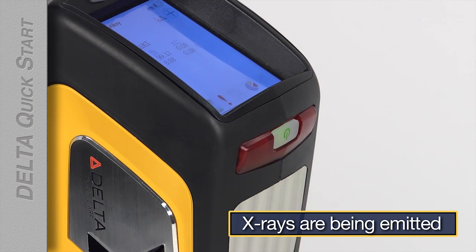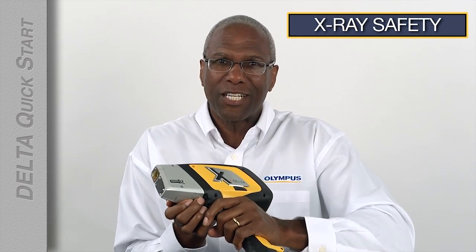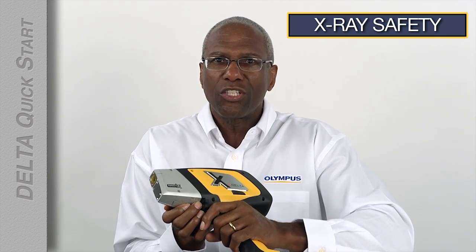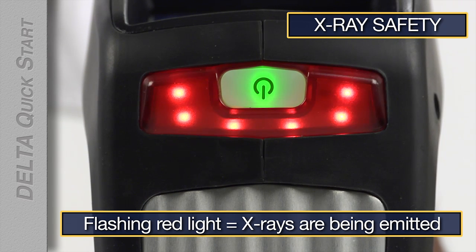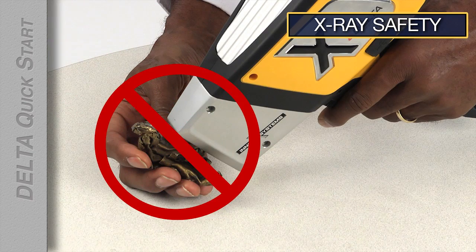CalCheck is an X-ray test, so the red X-ray indicator will be flashing to warn you that X-rays are being emitted. This is a good time to talk about X-ray safety. As long as you use your Delta Analyzer correctly and follow the recommended testing techniques and safety precautions found in your manual, you and everyone around you will be safe. Our instruments are secure and dependable, but there are a few things that are important for you to know. When the red light is flashing, X-rays are being emitted. Never point the analyzer at yourself. Never point the analyzer at anyone else. Never place your hand in front of the analyzer window.